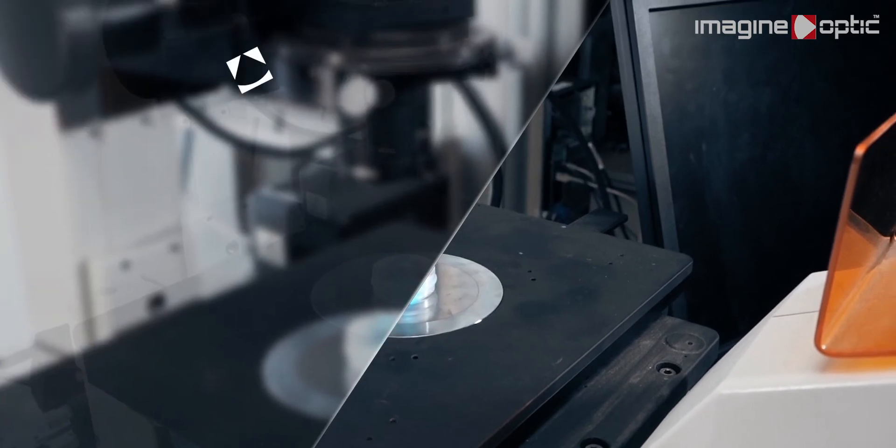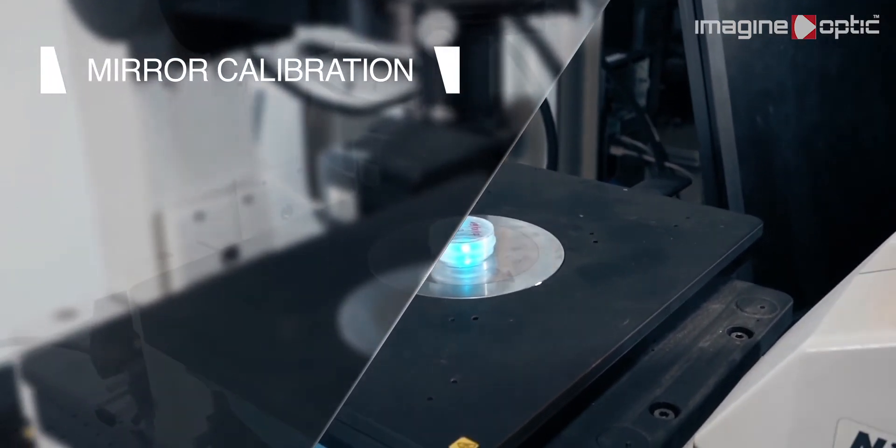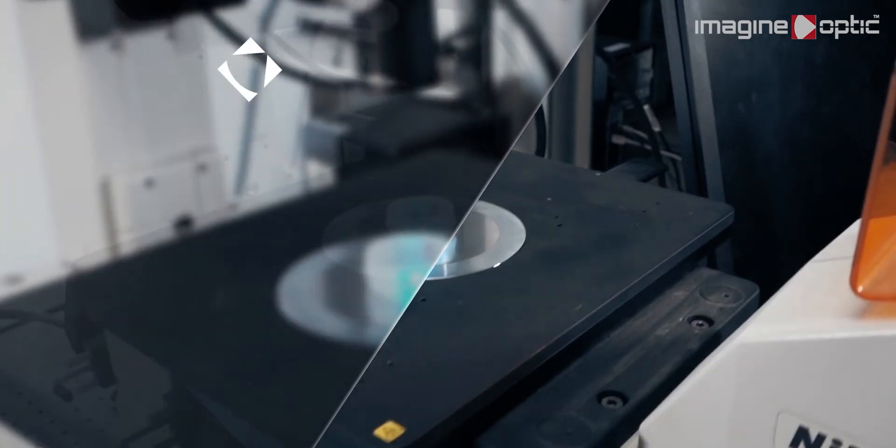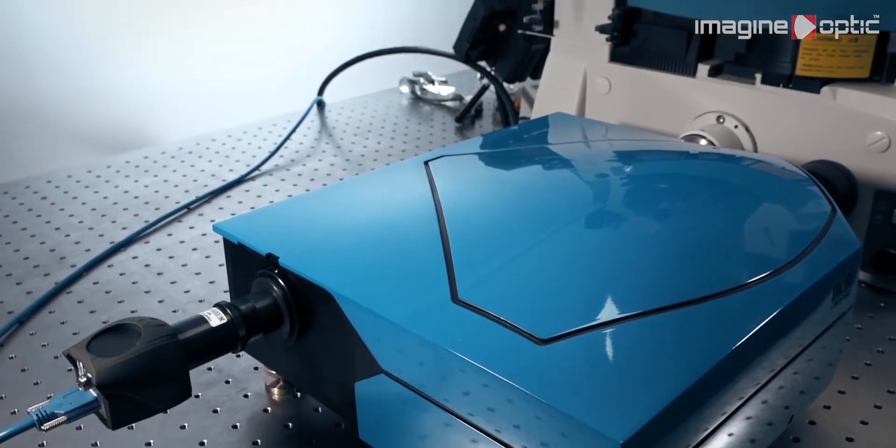Once Mikao is aligned, we calibrate the deformable mirror using a 1 micron fluorescent bead at the surface of the coverslip as a point source to measure the wavefront using the wavefront imager on the camera port of Mikao.